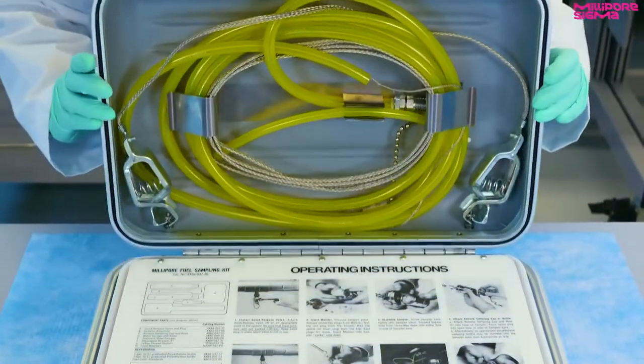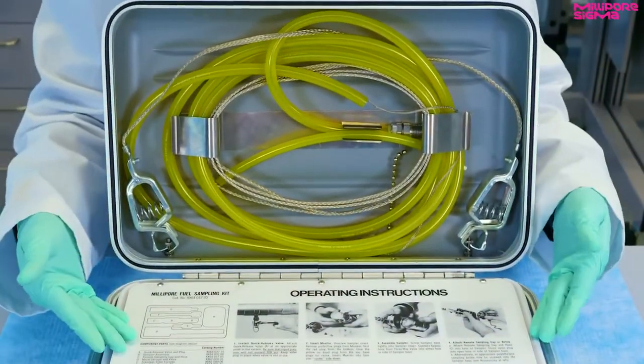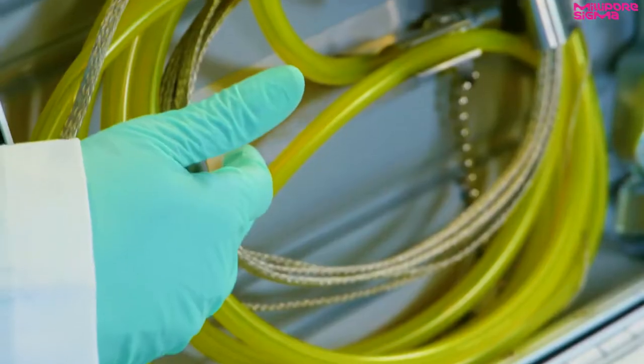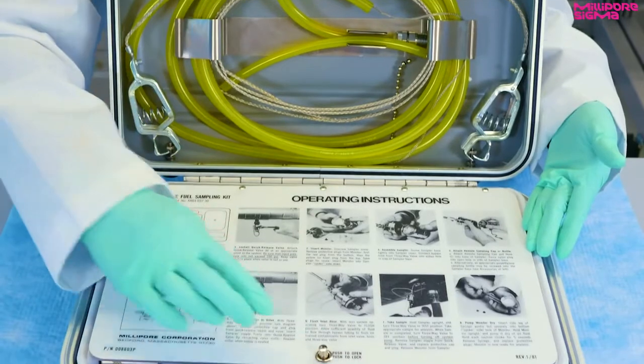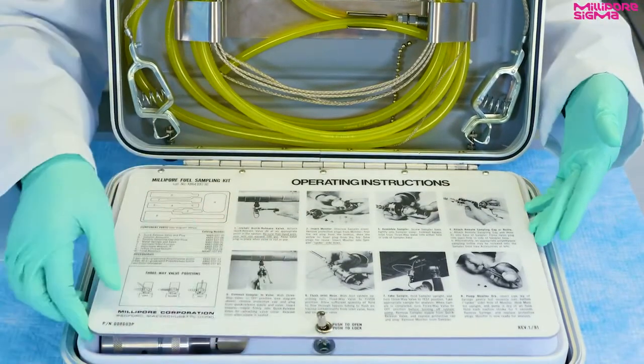This is the fluid sampling kit. General operating instructions are provided inside the kit. The hose and the grounding wire to the remote sampling assembly are found inside the lid. Let's take a look inside the kit.